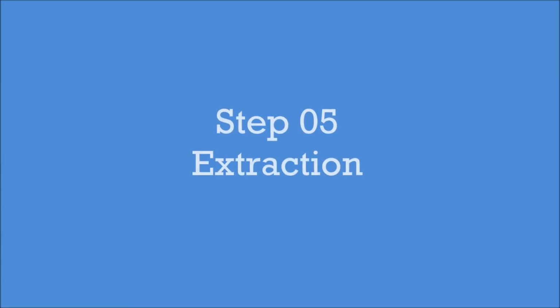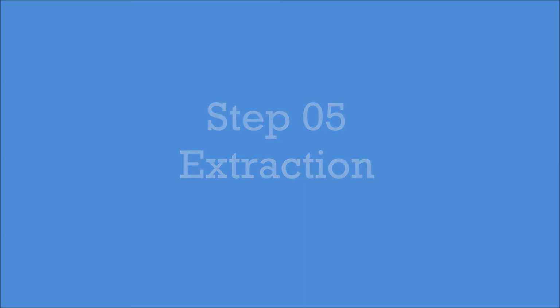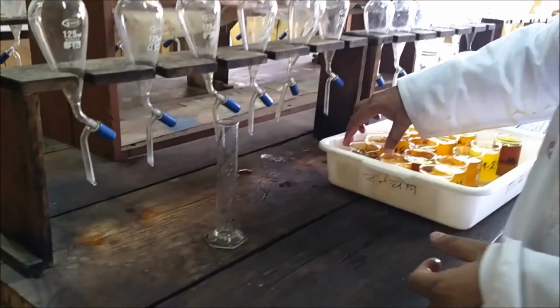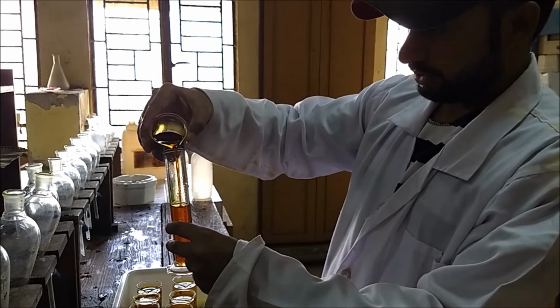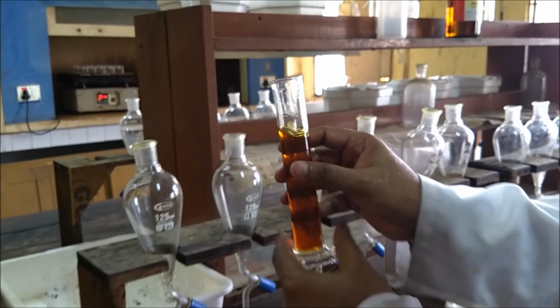Step 5. Extraction. This is the most crucial part of gold analysis, where gold is separated from the interfering element iron. Measure 50 ml supernatant liquid with the help of a measuring cylinder. Now transfer this liquid into the separating funnel.